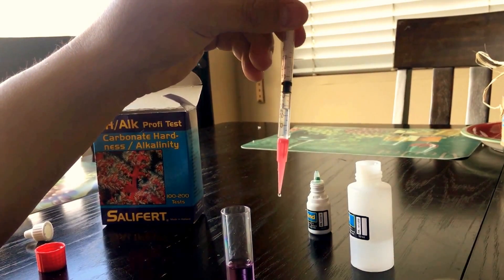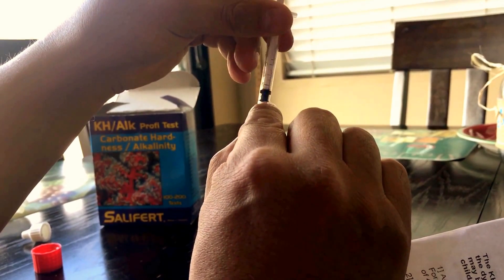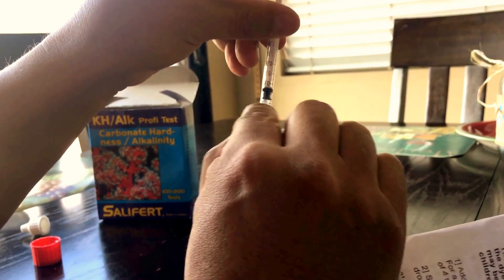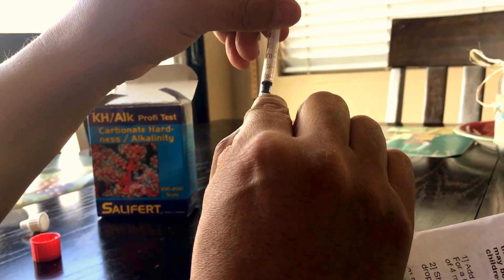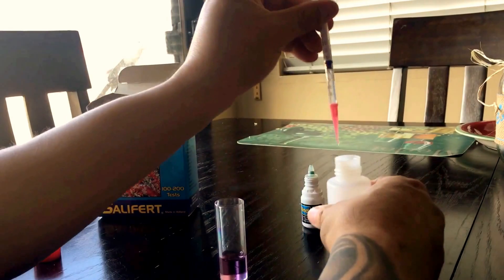And this direction here — it's 0.45. So you count: one, two, three, four, five. Okay, so this is 0.45.